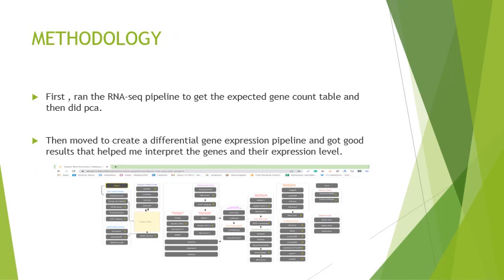Now, if I talk about the methodology, from the data set that I got, I initially ran the RNA sequencing pipeline to get the expected gene count table. This was my result that I got. A lot of results, but the important one was the gene expected count table.